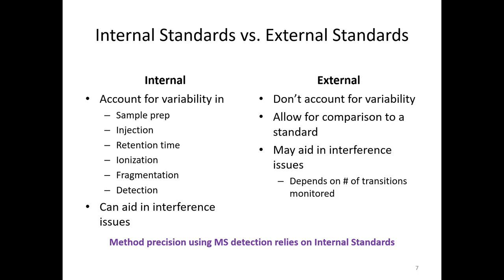Or if one of those peptides is below the limit of quantitation, then those intensities and that pattern are less predictable. The mass to charge of those product ions will be consistent, but we can't guarantee that the tallest ion will always be the tallest product ion and the smallest will be the smallest, because there just aren't enough ions to do it reproducibly below the limit of quantitation. So that's why it's always nice to have more than one product ion when you're monitoring these peptides. I always go for a minimum of 3 if I have an internal standard, and if I don't have an internal standard, I go for more, at least 5.